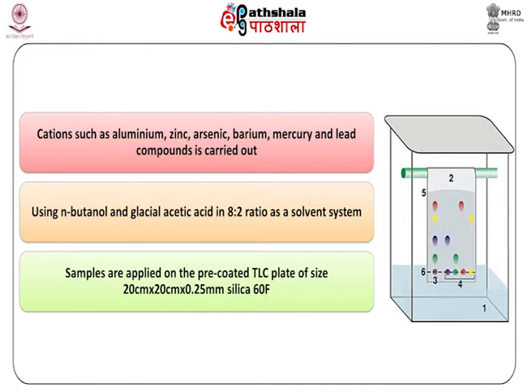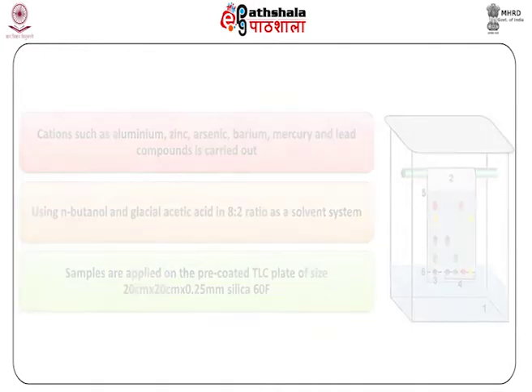Samples are applied on the pre-coated TLC plate of size 20 centimeters into 20 centimeters into 0.25 millimeter silica 60F.